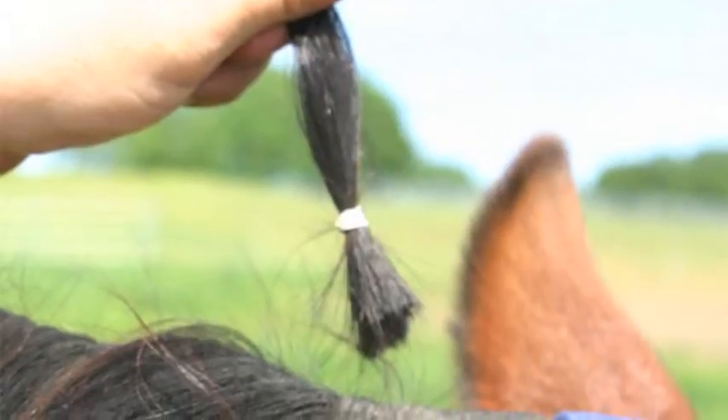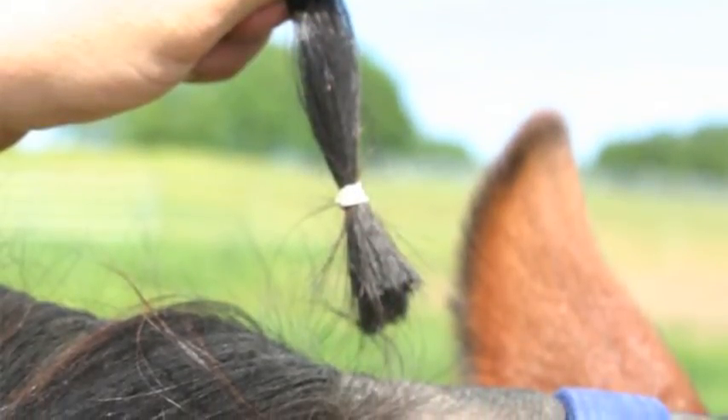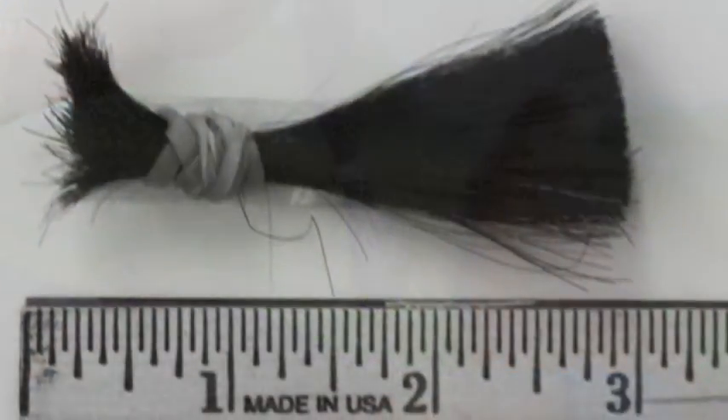Number three, if the mane is longer than three inches, please trim off the long end so the hair sample is the three inches closest to the scalp.